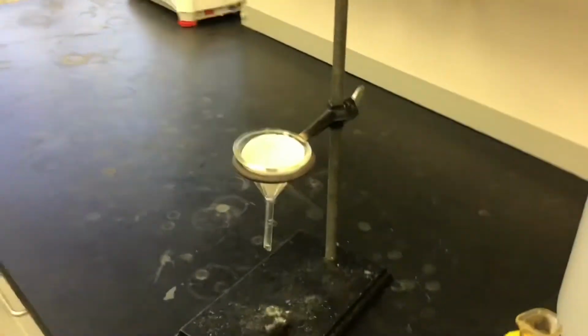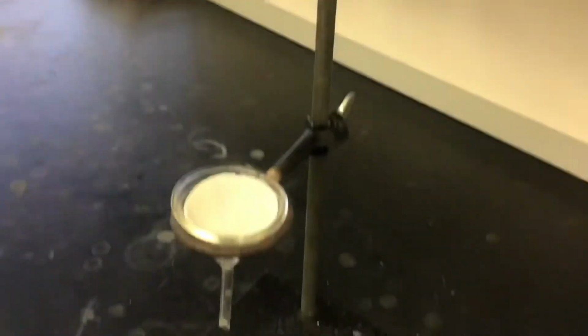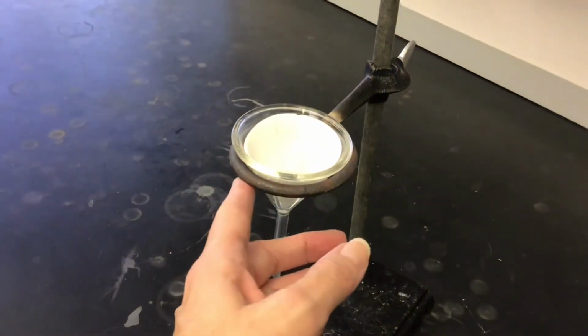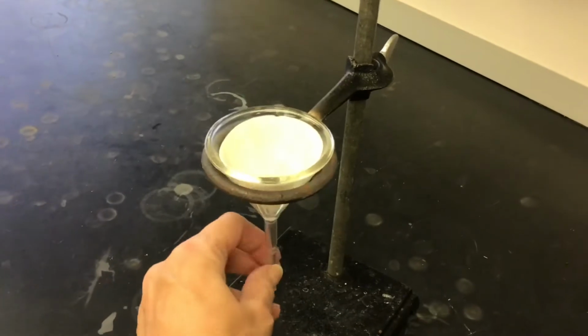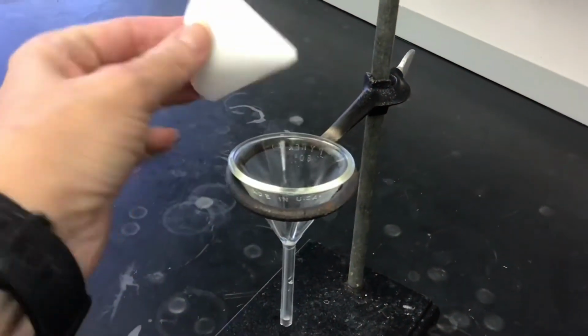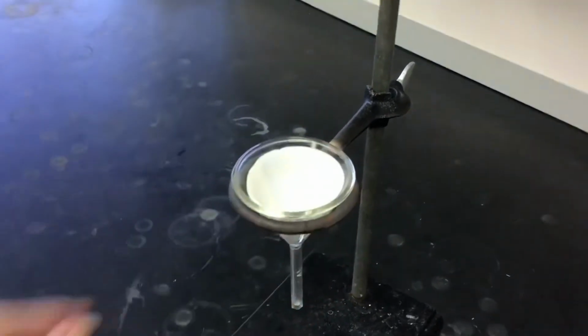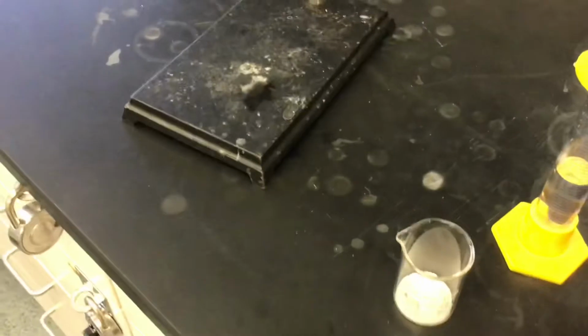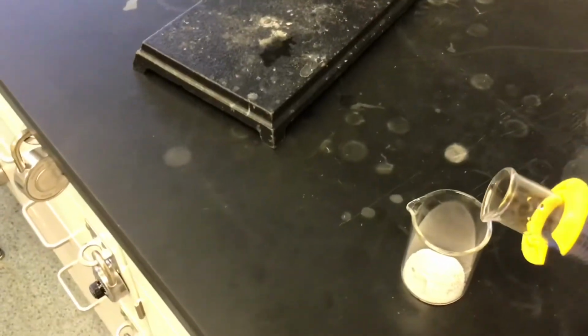So you'll notice here I put this apparatus together. I just have a ring stand here, okay? And then I have an O-ring with a glass funnel that I have filter paper in. So I've wet that filter paper, and I'm ready to pour my sample through. So I'm going to take this water and I'm going to add it.